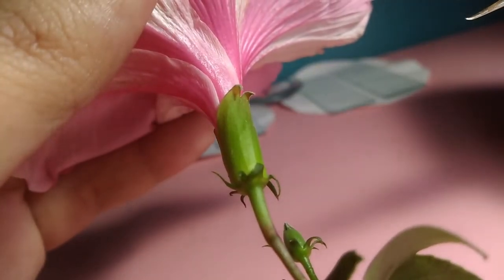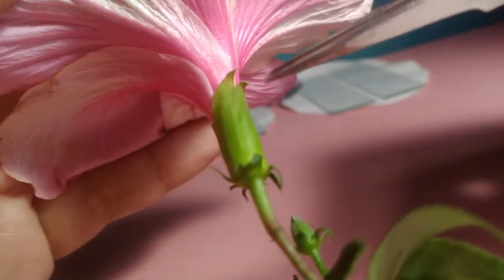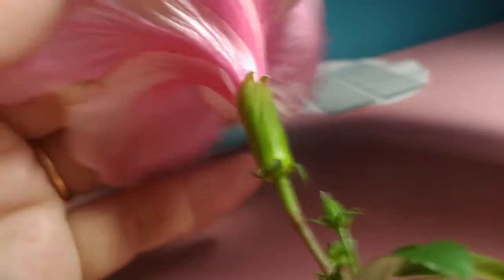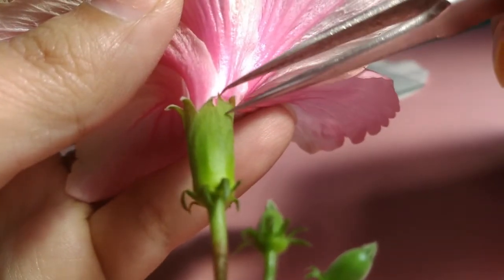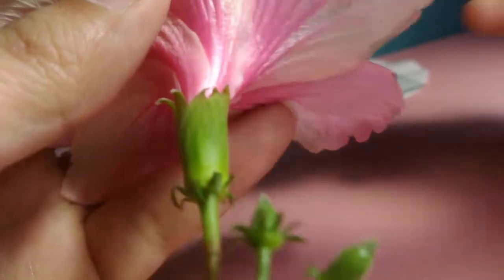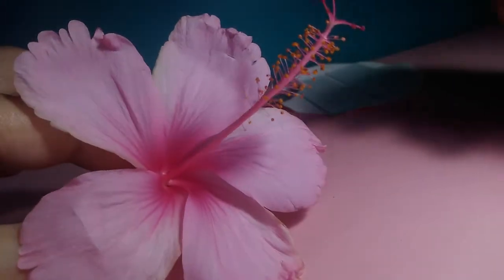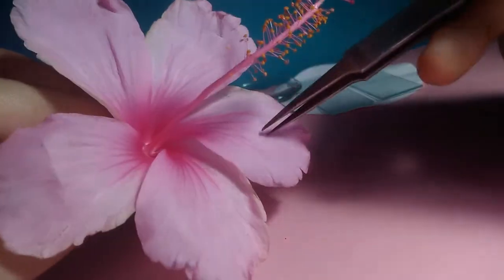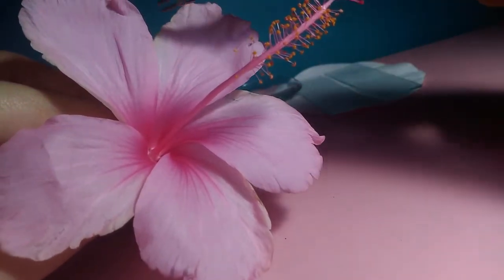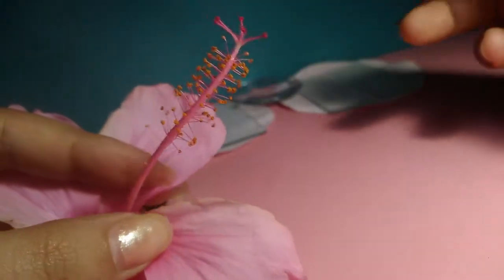Now let us count the number of sepals that are present here. So we have one sepal, then two sepals, this is the third one, this is the fourth one, and this is the fifth one. So we have 5 sepals in case of hibiscus. Now let us quickly count the number of petals. What are petals? These colorful, vibrant structures are actually the petals. And just like sepals, we have again 5 petals here. 1, 2, 3, 4, and 5.